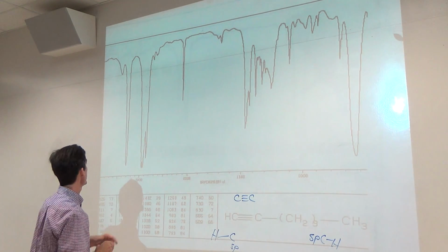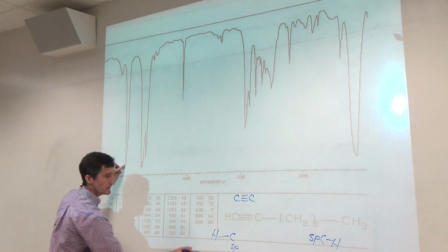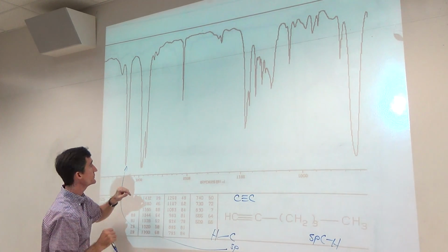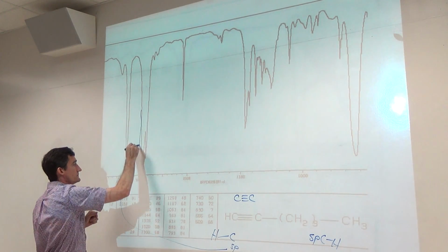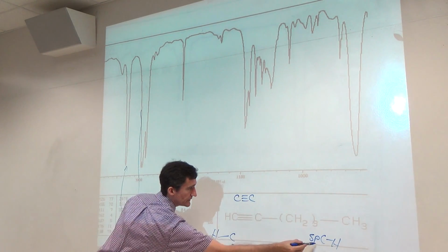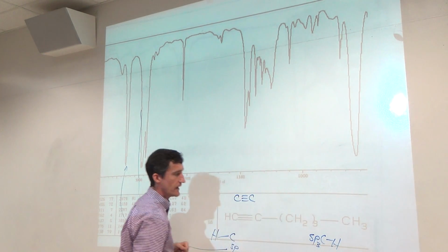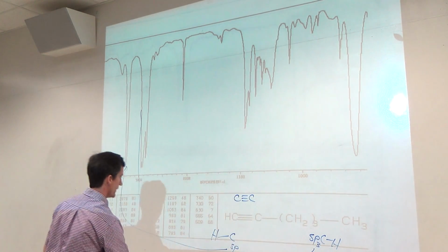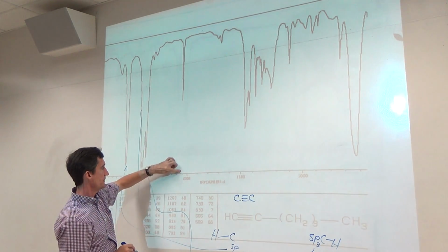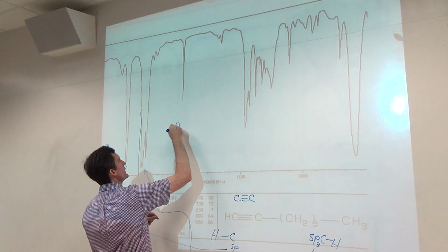Let's see what we have here. I've got a strong peak at about 3300. If you look at your table, it's this guy here. And it's strong, just like that table says. Magic line, if I can draw a straight line, this is your sp. Uh-oh, what do I need you to tell me? sp3 CH. Here. What is this peak at about 2120?